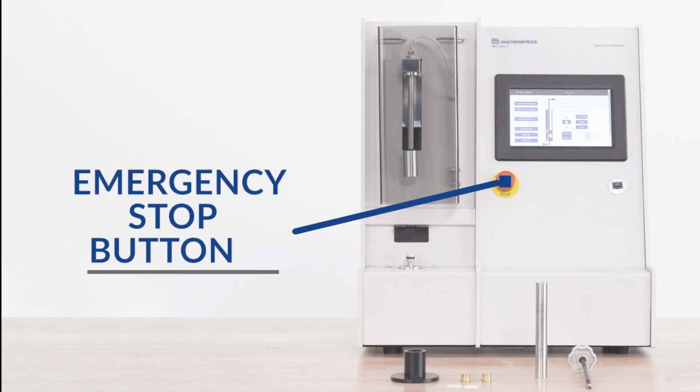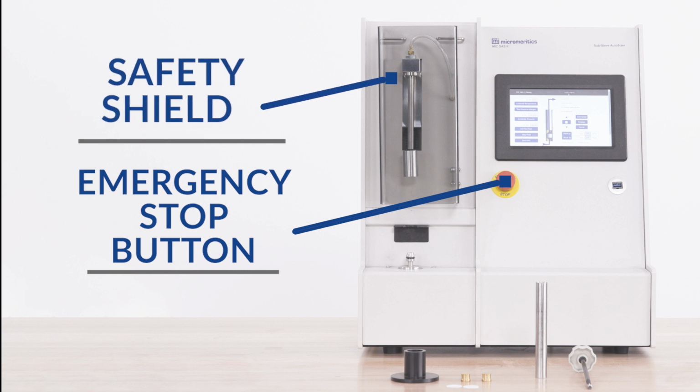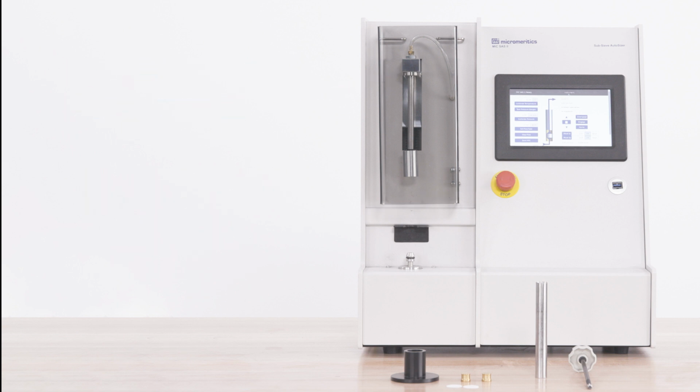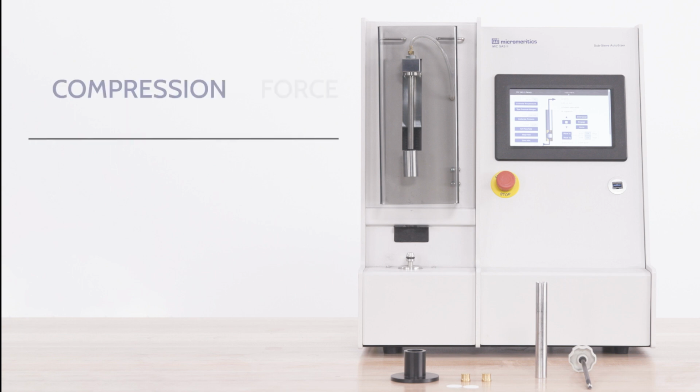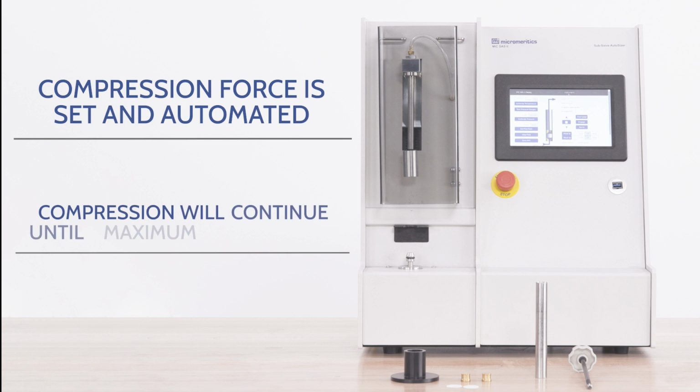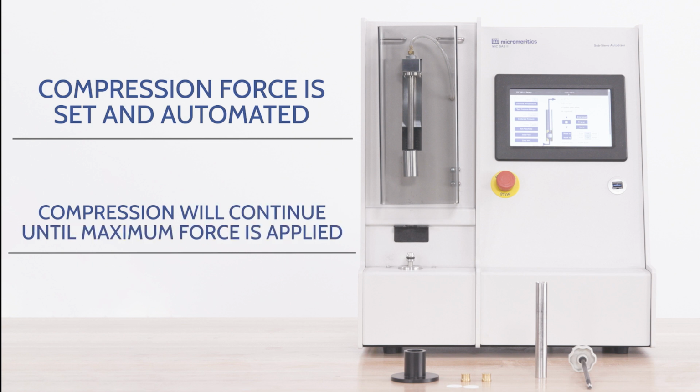There is an emergency stop button to turn off the stepper motor and a safety shield that must be in place in order to operate the SAS. These are safety measures since the compression force is set and automated. Once the compression begins, it will continue until the maximum force is applied.